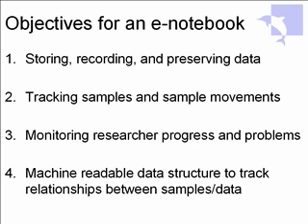And number 4 is kind of the dream, is where we'd like to be. We'd like all of this data to be in a form that can be processed, possibly not by us, possibly by other people, but really to be able to go back and understand if we got this result and that feeds back to some material that we bought from a supplier 2 years ago, can we link those things together? Is this particular primer, chemical, whatever, bad for whatever reason? And can we figure those things out? Or, as I'll come back to a bit later, can I tell who used up the last of my buffer? Little things like that could be quite useful. So those are kind of our objectives, our starting point.